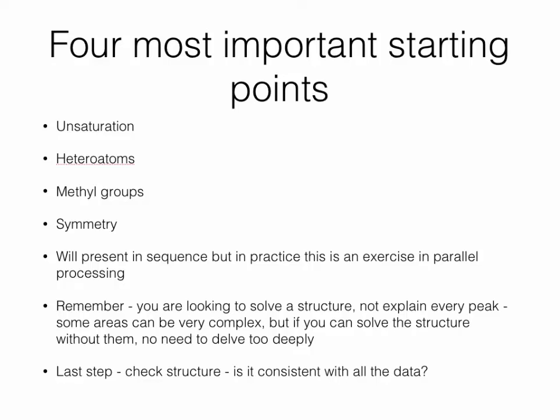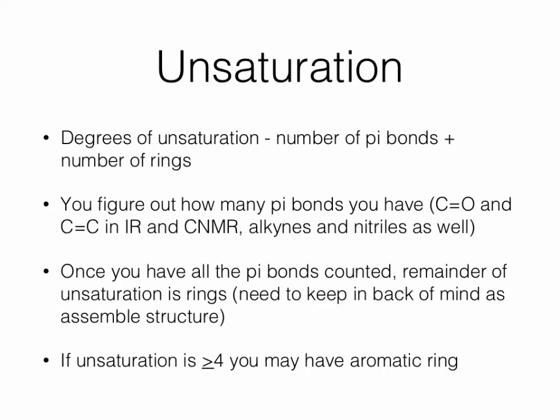There's always a good last step. Once you think you have a structure, go back and make sure that the spectrum is consistent with the structure you proposed, and that all peaks are present and accounted for, and there are no extra peaks that are going to contraindicate the compound you have chosen as your solution.